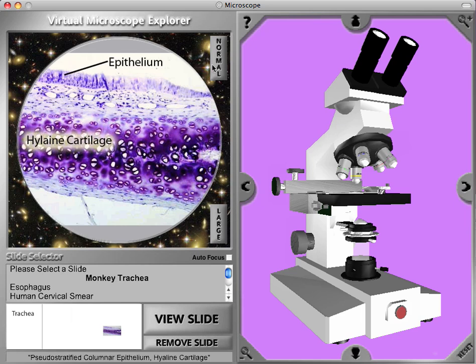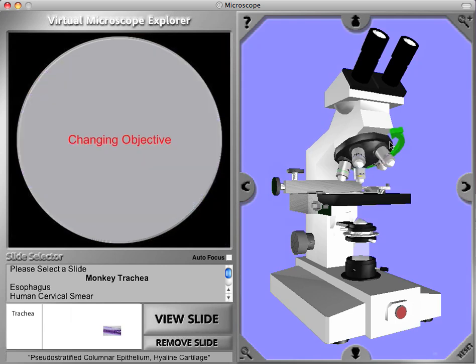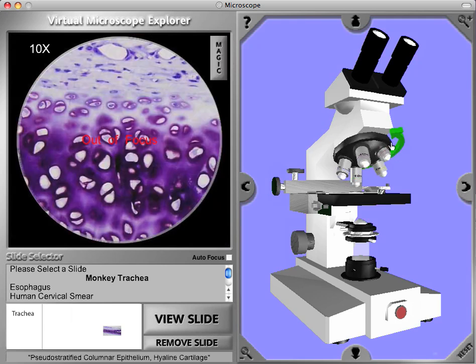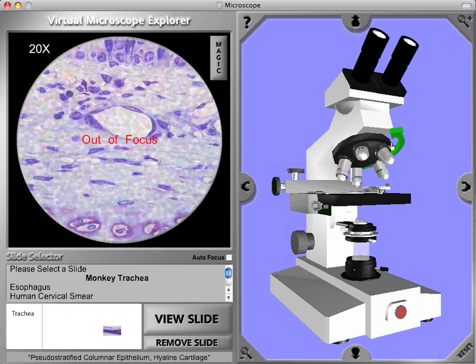So let's put our hand on the right side of the microscope and click two times to go up to the 20x magnification objective, and we need to focus again.